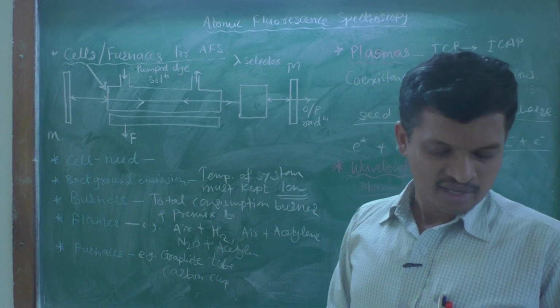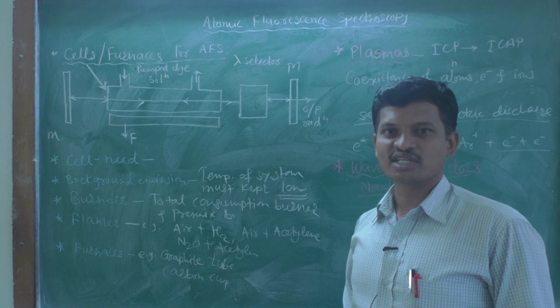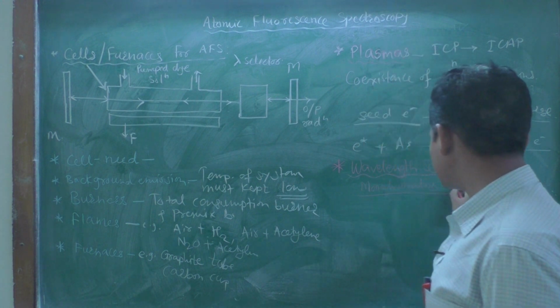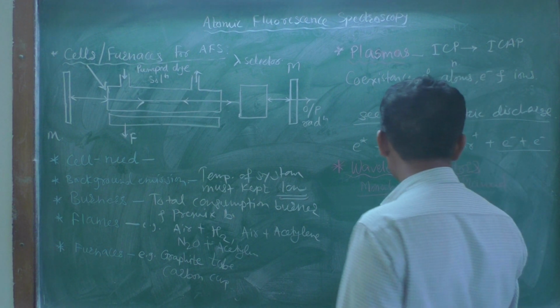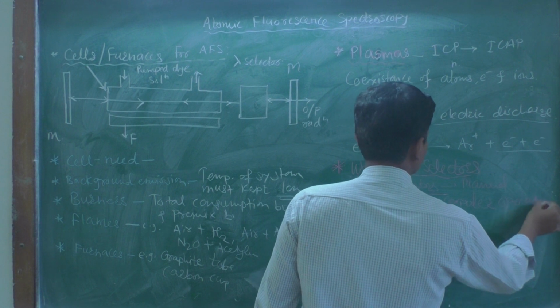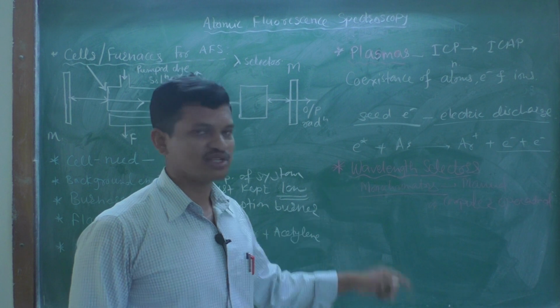Both manual or computer operated monochromators can be used as wavelength selectors.